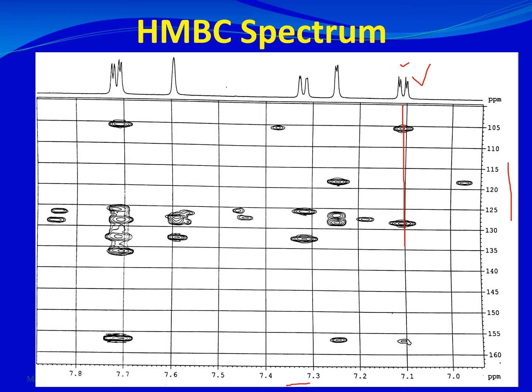Drawing a line down from the 7.1 ppm proton, it passes through three contours. The first contour meets the carbon scale at about 105–106 ppm, the second at about 128 ppm, and the third at about 157 ppm. This means the proton resonating at 7.1 ppm has three carbons nearby: one at 105, one at 127, and one at 157 ppm.